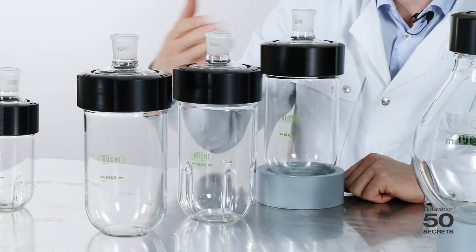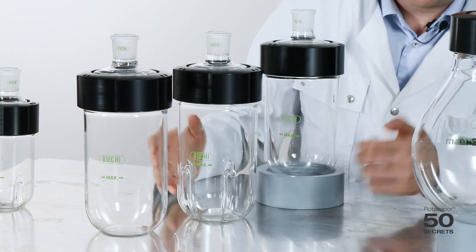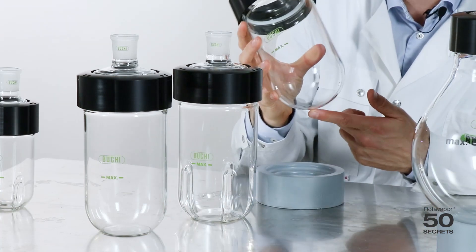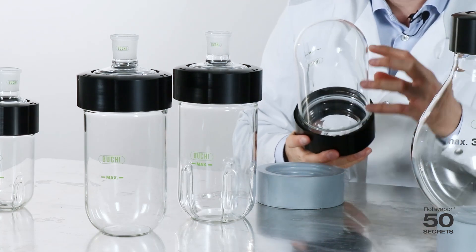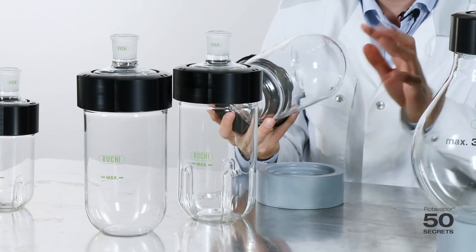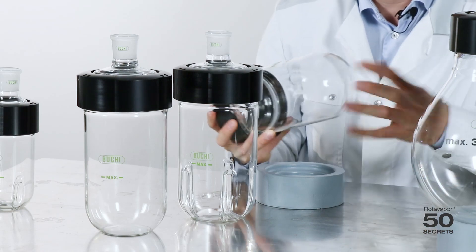This is the 1.5 liter range — we have three different ones. The first is the standard one, the second has drying notches, and the third is quite special: it has a round bottom, the same as a normal flask would have. The advantage of this one is that you can very easily put it into a dishwasher. We use this a lot for bars with rotary evaporators — very easy to wash.